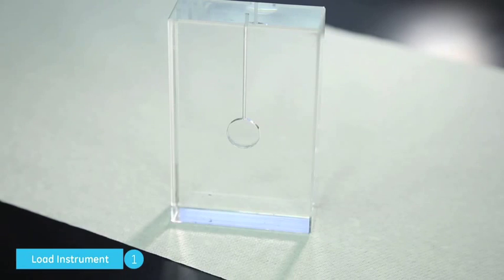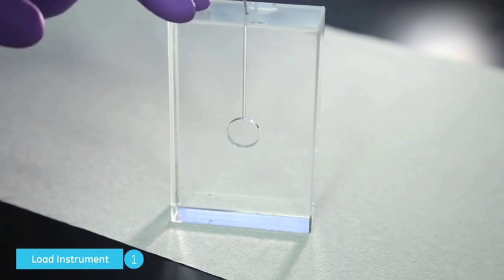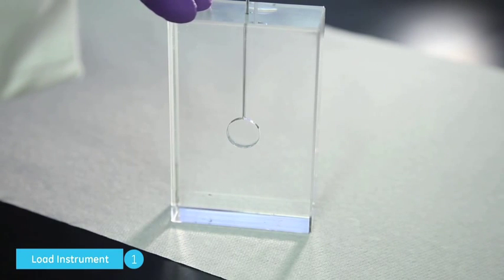I'd like to demonstrate how to load the sample cell using this transparent model. Load your filling syringe with about 300 microliters of sample. Slowly insert the loading syringe into the sample cell port. Gently touch the bottom and come back up so that you are about one millimeter from the bottom.